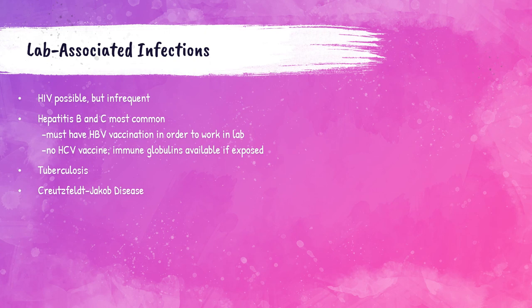Possible infections from working in the laboratory include HIV, which is possible but infrequent. HIV attacks the body's immune system and can lead to AIDS. There is no cure, but recent treatments allow patients to live long healthy lives. Hepatitis B and C are the most common laboratory-associated infections — viruses that primarily affect the liver. Most labs require workers to have a Hepatitis B vaccine series; there is currently no Hepatitis C vaccine, but exposed workers can be given immunoglobulin medication.